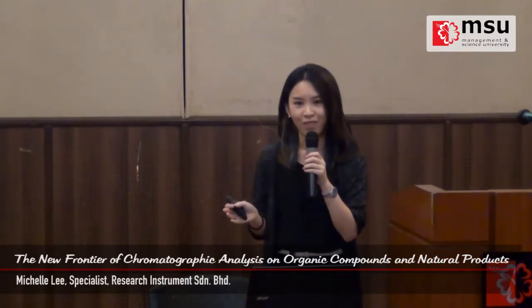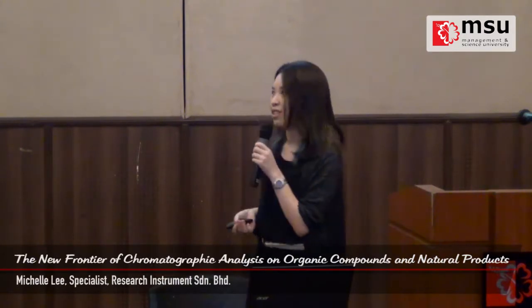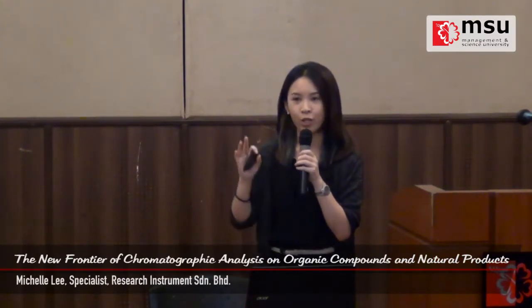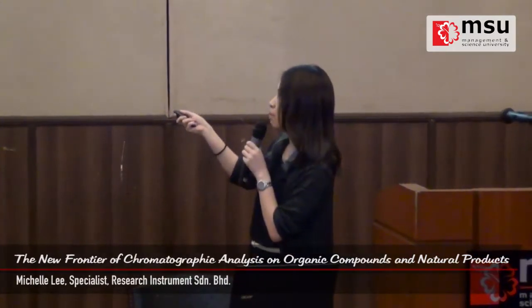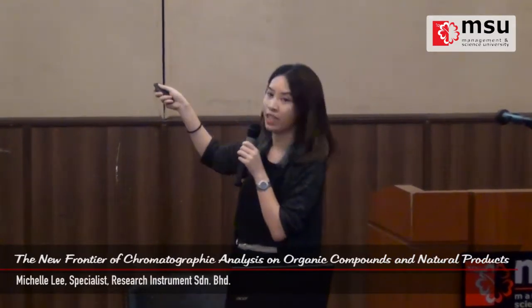So a very basic definition is chromatography is like separation. Chromatography is actually to separate components, a mixture of components. To describe to you how thin layer chromatography works, you can imagine this scenario. I want to categorize a big group of people into subgroups depending on their interest. Each of them sits inside a boat, and you will have this river current which is flowing towards the finish line.